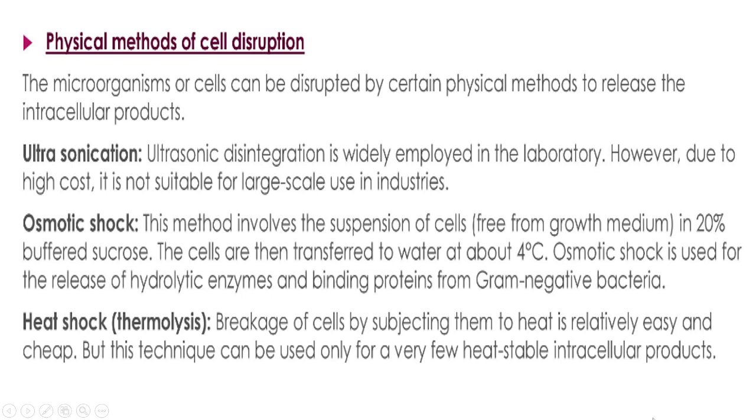Then osmotic shock: you transfer the bacteria from one medium having a different osmotic condition, like 20 percent sucrose, suddenly into 0 percent sucrose or plain water. So the bacteria face an osmotic shock.